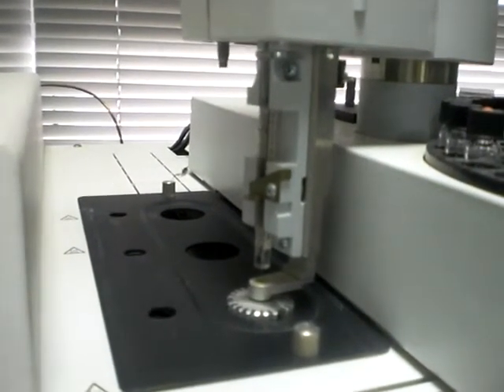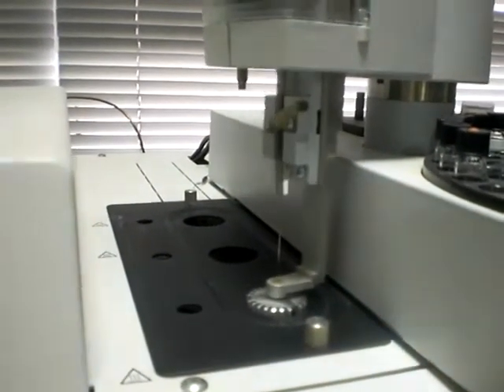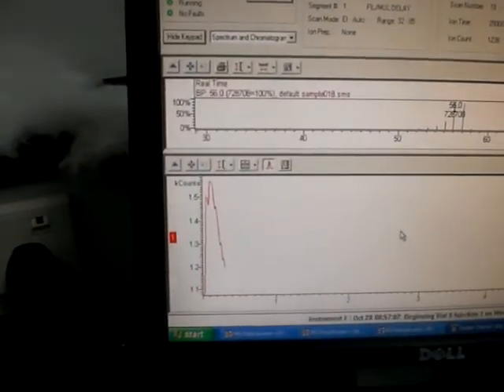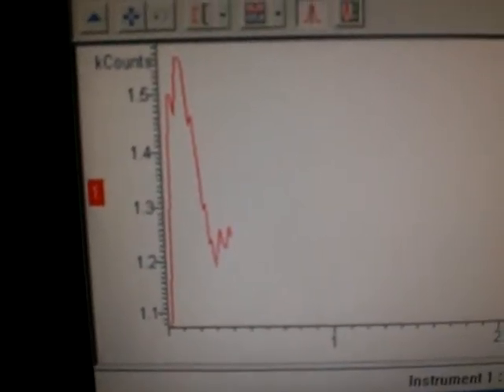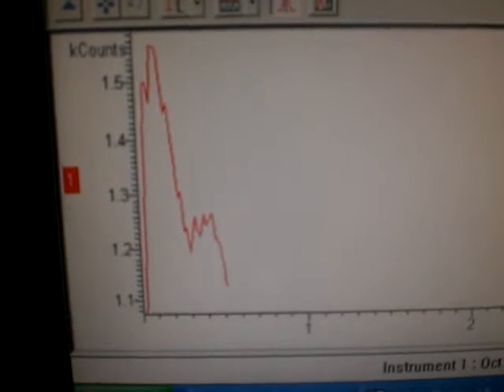See, very quickly. Now the sample will go with the nitrogen gas as a mobile phase, or helium gas sometimes, to the column. Then we will see here the chromatogram start to be detected. See here. Now the mass spectrometer will detect the analyte coming from the gas chromatographic column.